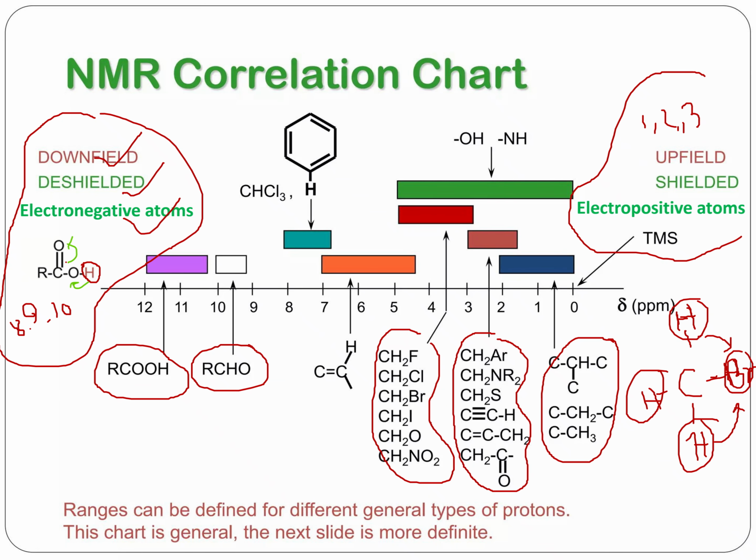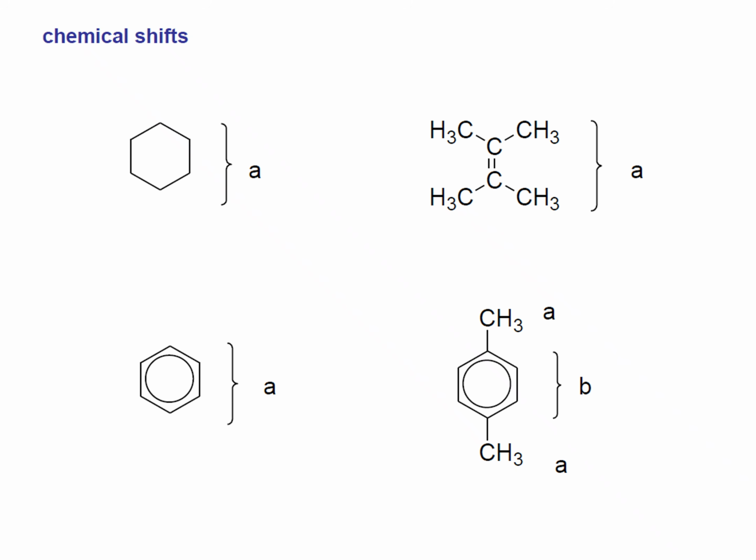So what is chemical shifting? What does chemical shifting mean? It means that in the structure, if you provide some electronegative atom, then it would be shifted towards the downfield, and then the chemical shifting will happen. Let's understand this clearly in the upcoming slides. Here is one environment, so no chemical shifting. Just one type of environment, no chemical shifting. But you can see here a chemical shifting, because of two environments. Whenever two environments are created, it will cause chemical shifting.